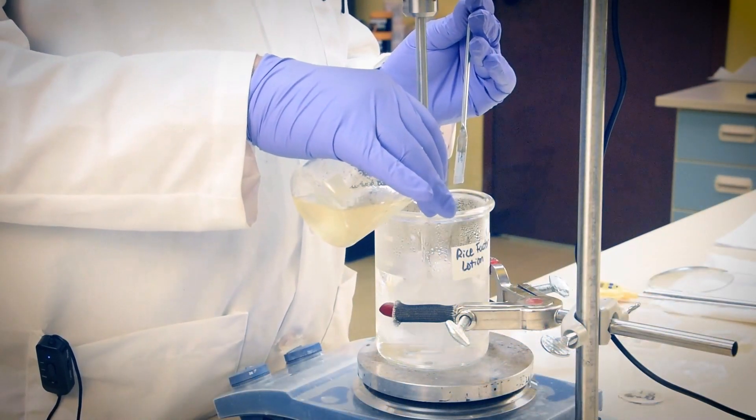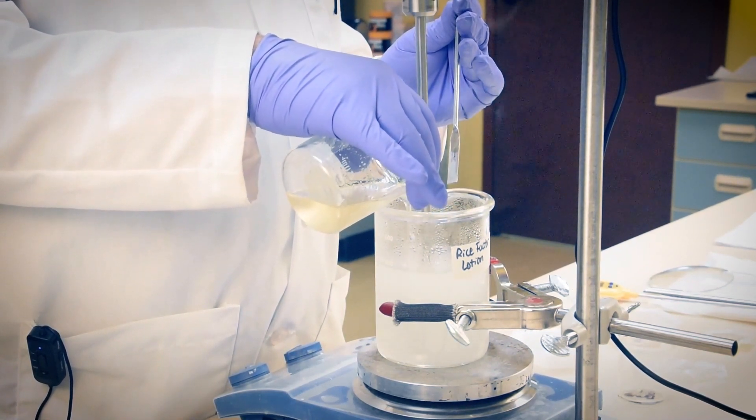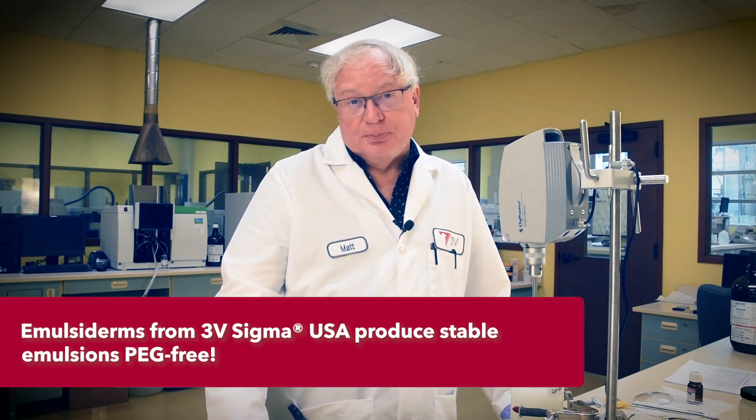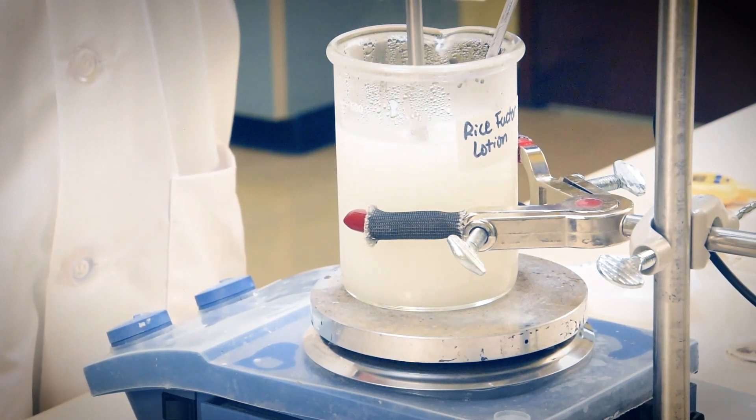Both of our phases are ready at 75 to 80 degrees Celsius, so now we'll combine them. We've mixed our batch at high speed for about 10 minutes now and stopped heating too. At this point, we have a virtually stable flowing emulsion. We'll let this mixture slowly cool in only moderate agitation before completion.